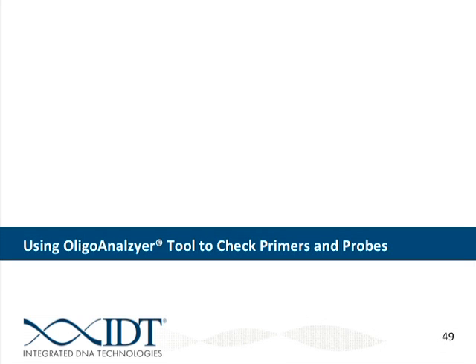And so now we're going to go through how to use OligoAnalyzer to check these primers and probes. So we've got a good assay. It's highly specific. Does anybody have any questions on any of the NCBI stuff before I go back into PrimerQuest and OligoAnalyzer? Okay.